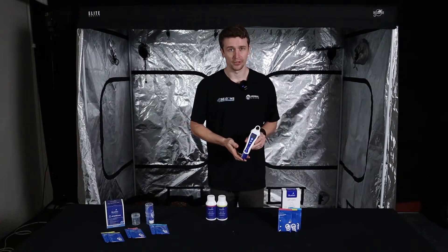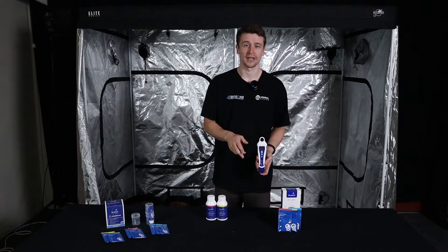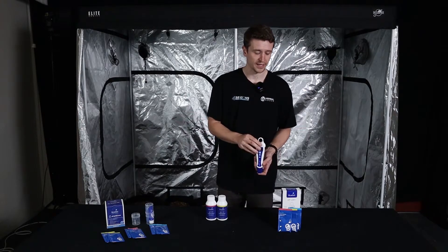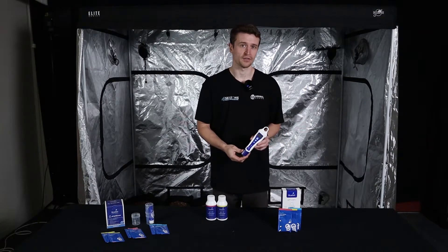Starting with the BlueLab PH pen, when you purchase it you get this beautiful box — PH pen inside and three sachets. Two of these sachets are for calibrating initially out of the box, and there's also some storage solution for topping up in the base of the cap, which helps look after the probe or sensor of the pen.